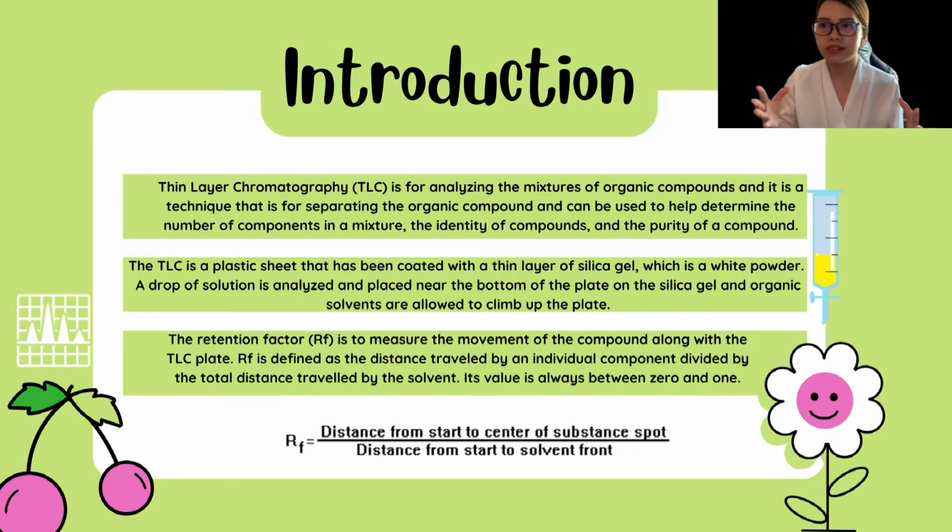And the next one is the retention factor. This RF is to measure the movement of the compound along the TLC plate. RF is defined as the distance traveled by an individual component divided by the total distance traveled by the solvent. Its value is always between 0 and 1. So here is the equation of the RF.